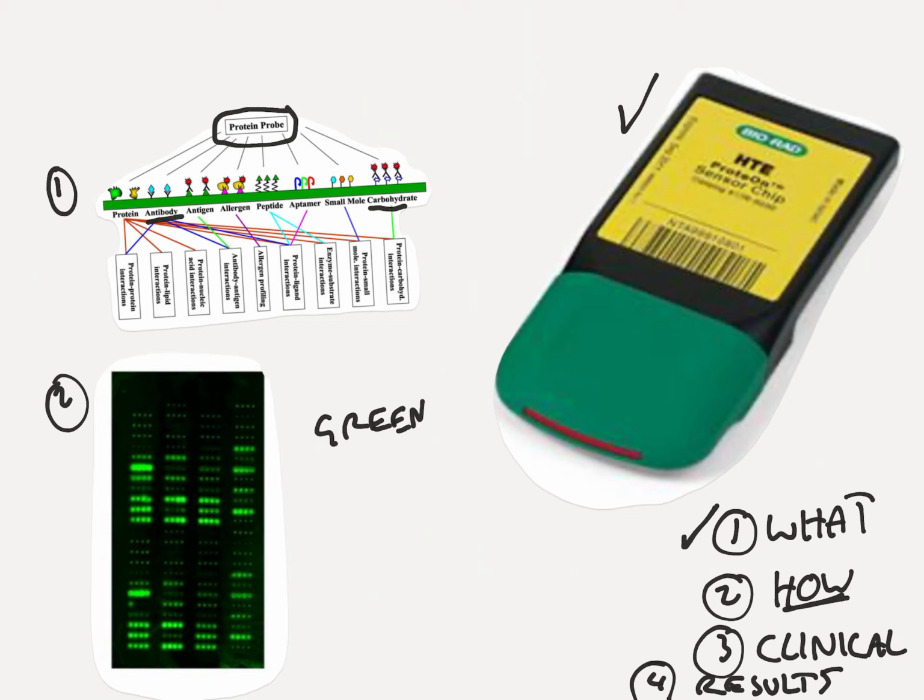And if that specific molecule is present, then you'll have a green light showing that it's there. If not, you don't get the light. The green light I'm talking about is shown in the lecture notes in this really nice, neat image we got here with a bunch of dots.